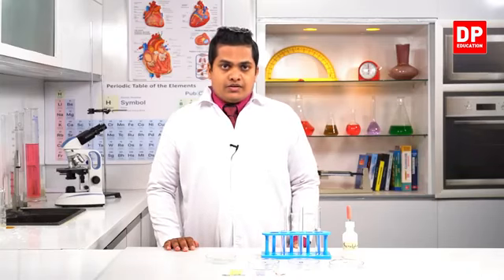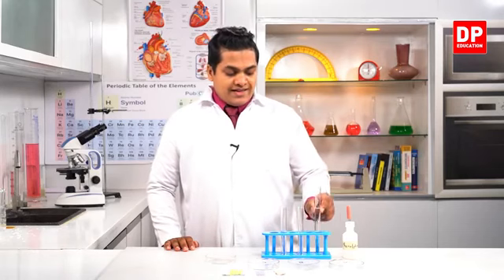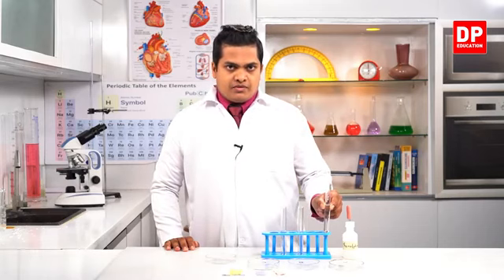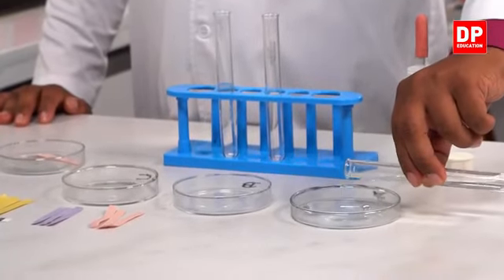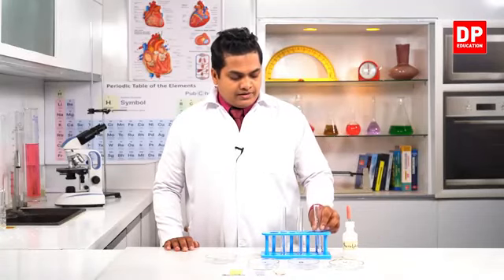Okay. So first of all, I am going to use this A solution. So we know that A solution contains HCl, right? So we'll add some amount of A solution into this A Petri dish, right?